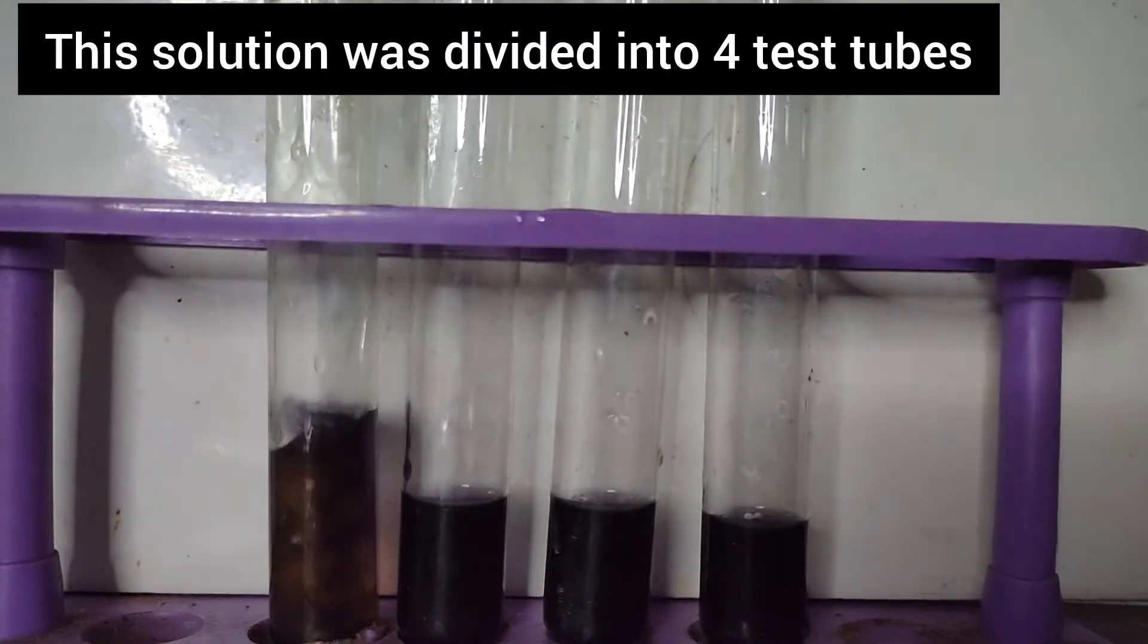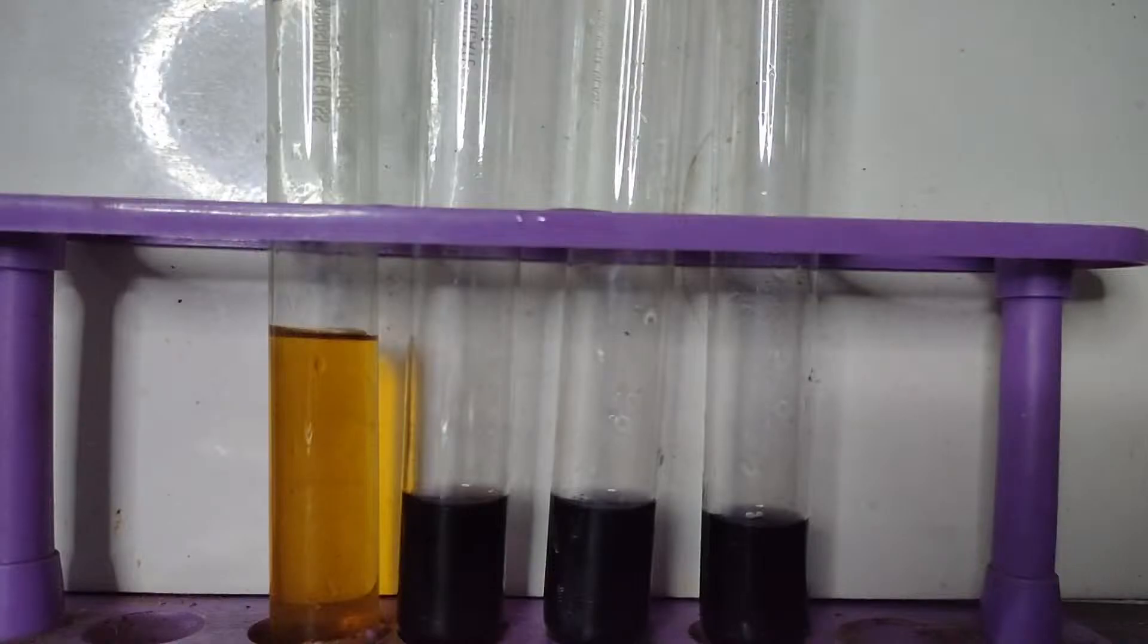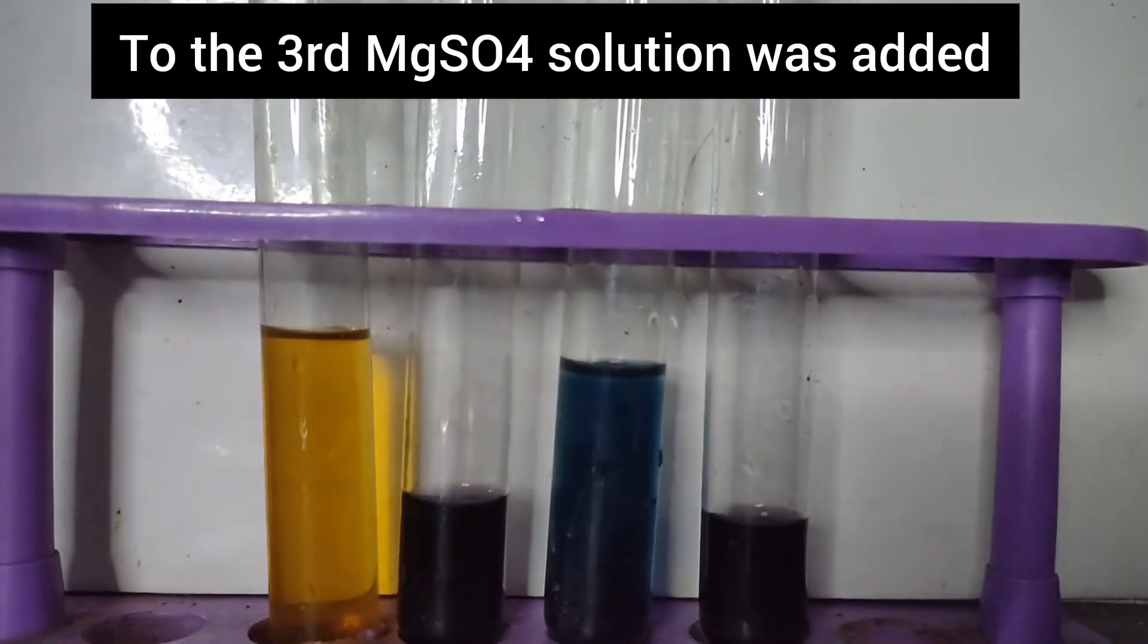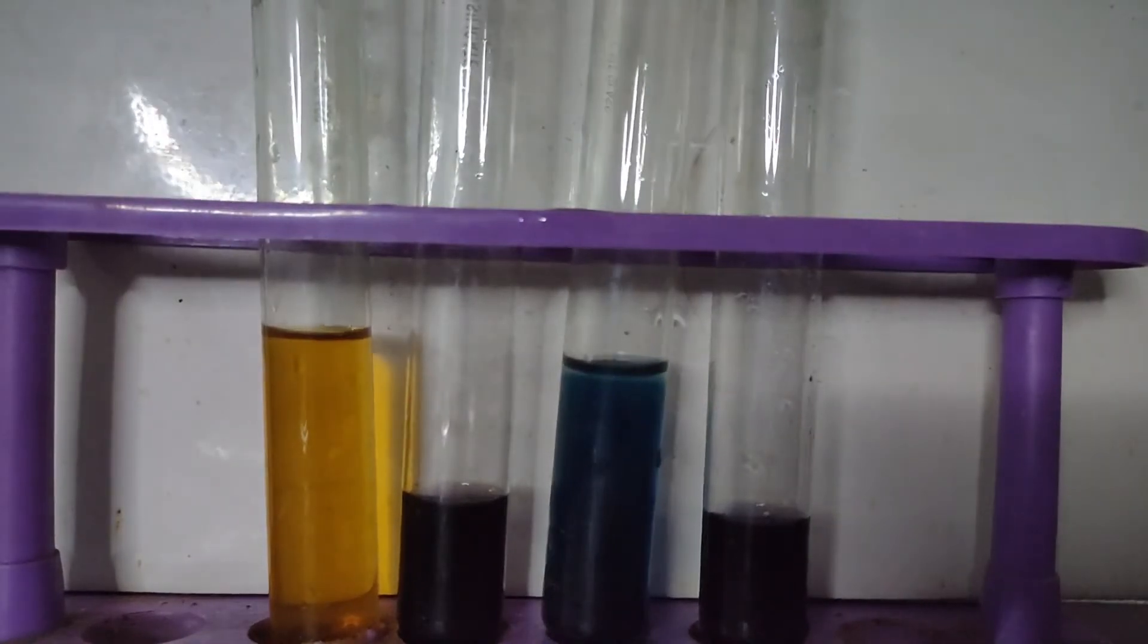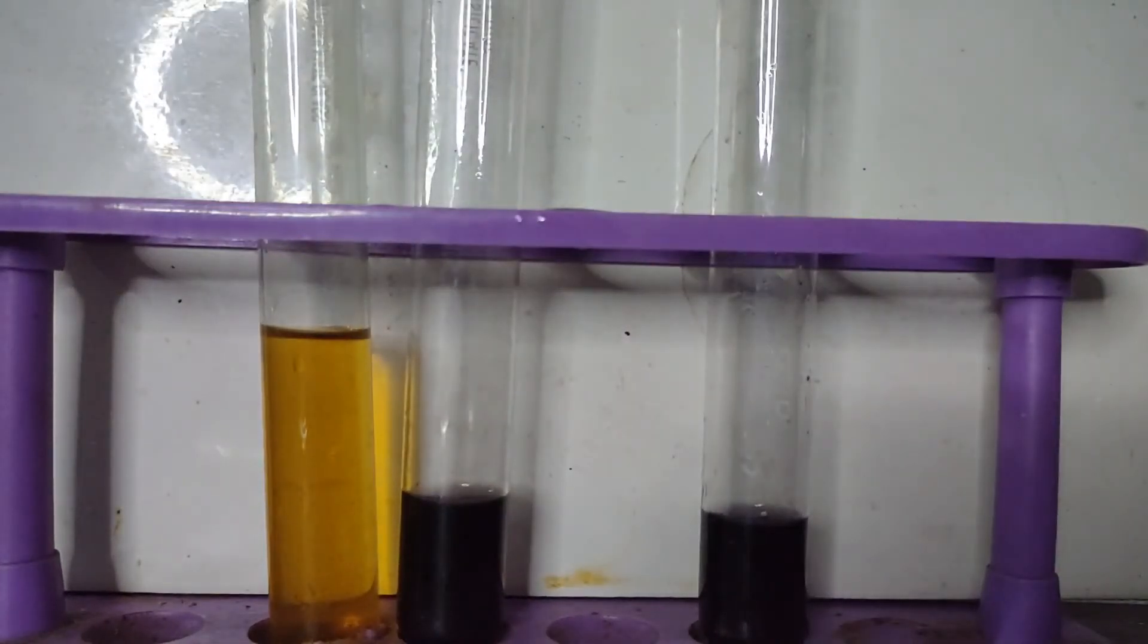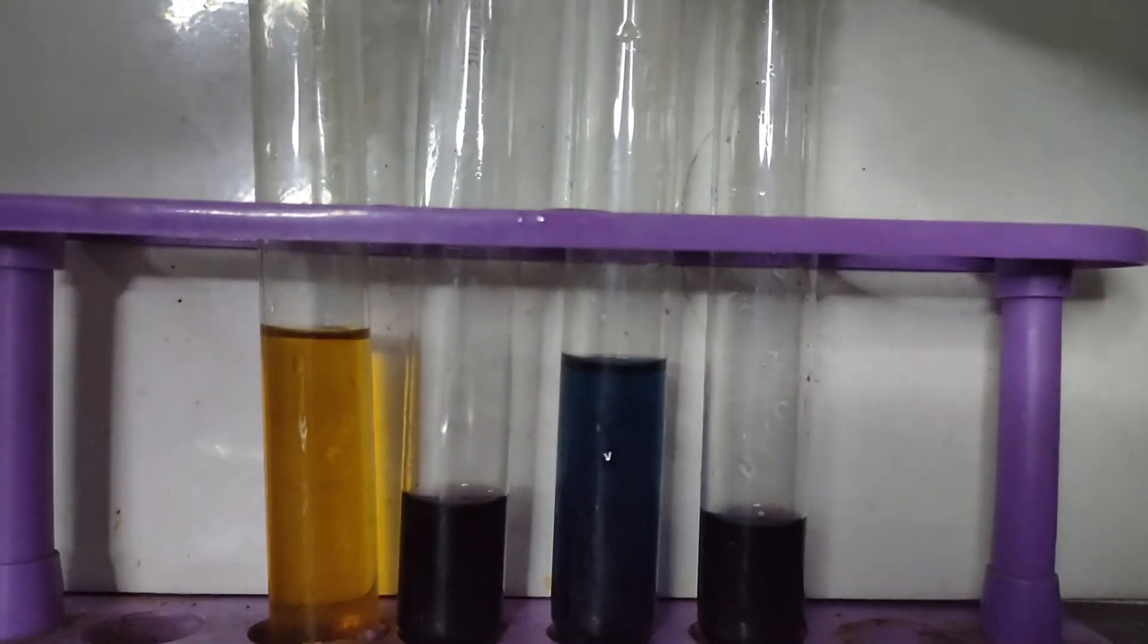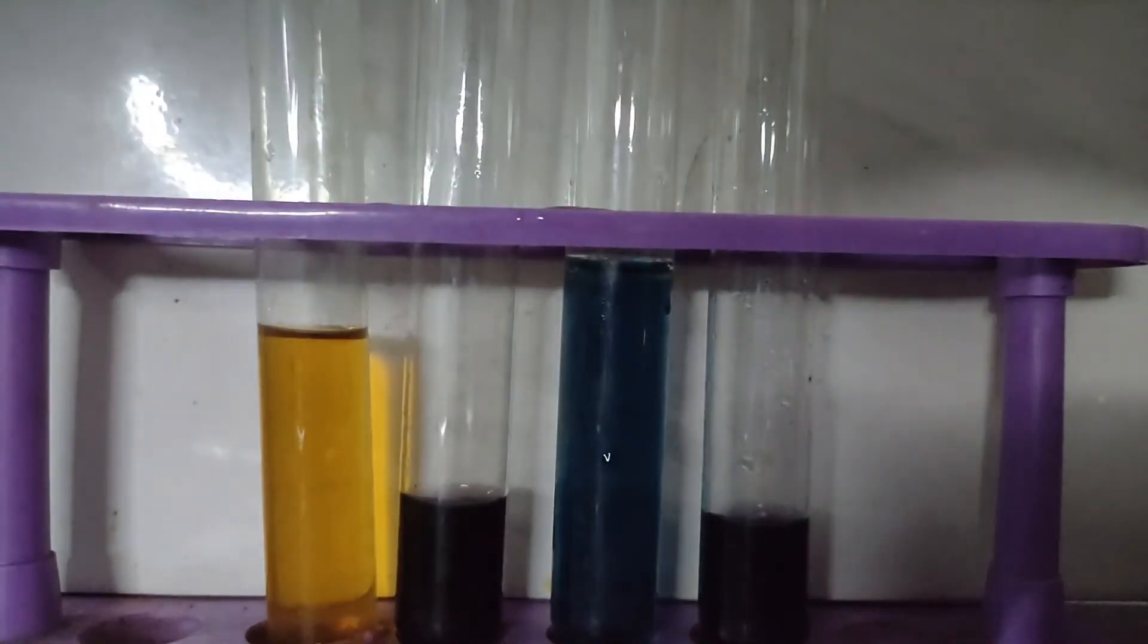This solution was divided into 4 test tubes. In the first test tube, dilute hydrochloric acid was added and the color changed to yellow. In the third test tube, magnesium sulfate solution was added and a blue lake is formed. Therefore, this dye is also used for testing magnesium ions as it gives a blue lake in alkaline solution with magnesium ions.